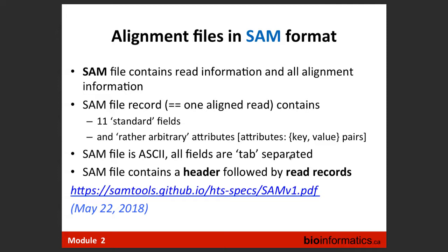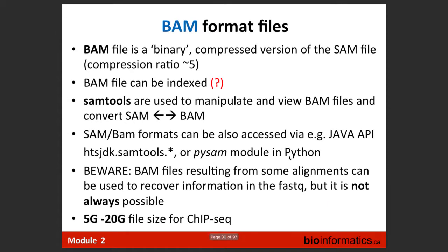So I put a reference to the specifications, which are updated constantly and are rather clear. My suggestion, and I really can't influence people much, but my suggestion is, even if somebody did the alignment for you and you already have those files, and if you want to work with those files, spend a couple of hours, read the documentation once in your life, carefully, everything. Then you know it. It's your luggage then. Because at some point it will be useful. So BAM stands, as I mentioned, for binary.